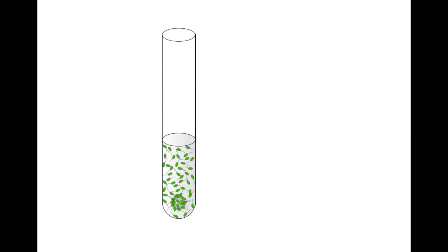In the case of our experiment, in which we only want to transfer the bacteria that are really good at forming biofilm, we transfer only the bacteria that have been able to stick to the bead into a new evolution tube containing fresh media and a new plastic bead.